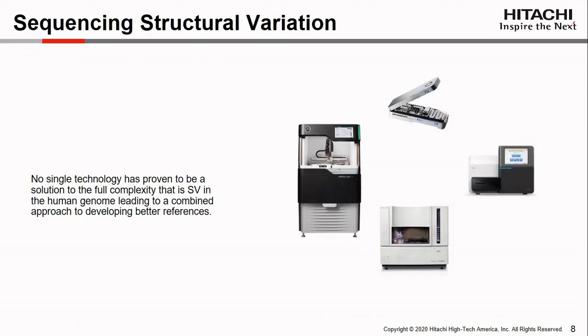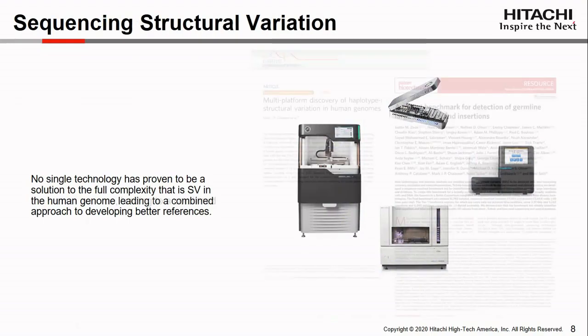Oxford Nanopore is another promising long-read sequencing platform that only recently started supporting SV calling. The platform promises read lengths in the hundreds of kilobases. However, typically reads fall into the 20 to 30 kb range, and the results are error-prone, with rates ranging between 5 and 15%. Their latest flow cell and chemistry purportedly improve on this performance, but the approach relies heavily on consensus sequencing that may impact the haplotype.